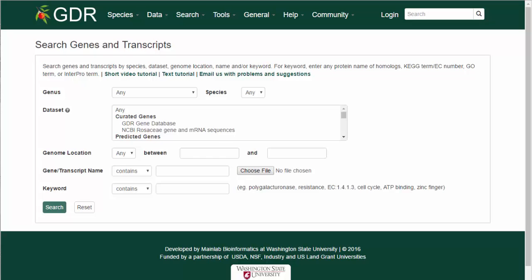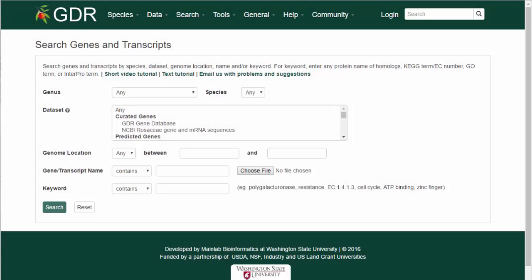A few parameters can be used to return a broad range of results, or numerous parameters can be used to find very specific data. I will now demonstrate a few different searches.